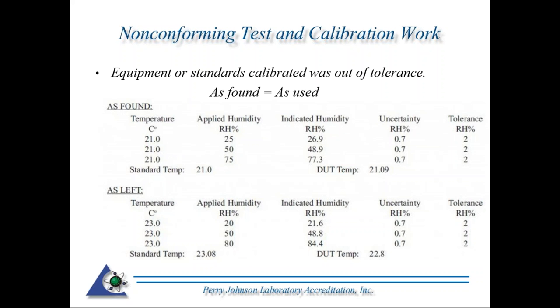So in other words, that is how you were actually using the equipment before it got into the hands of the calibration lab, and hence that data is recorded as "as found." And then the "as left" is how they left it. Many instruments could be adjusted.